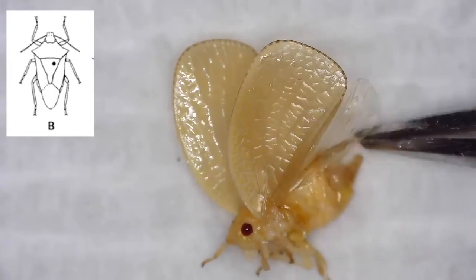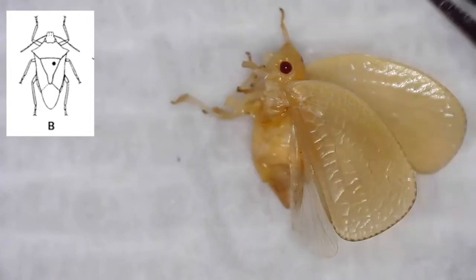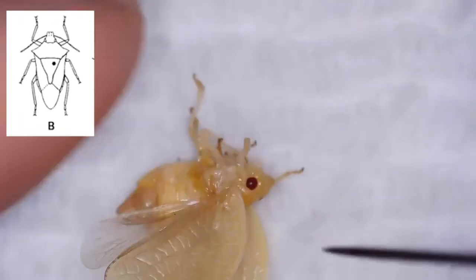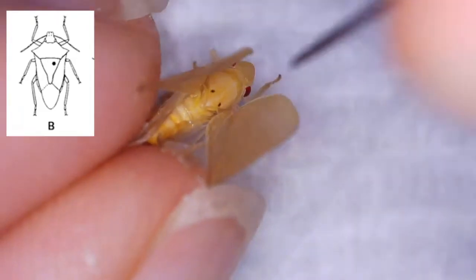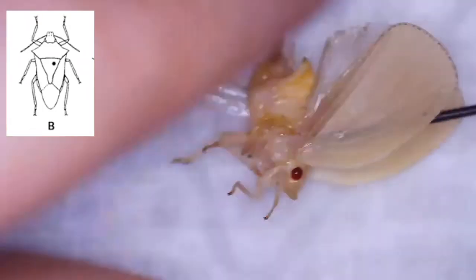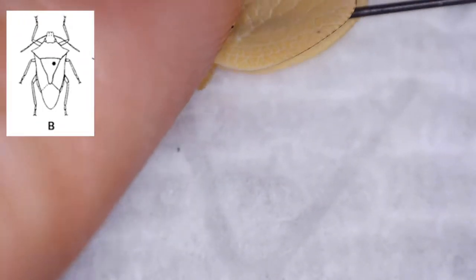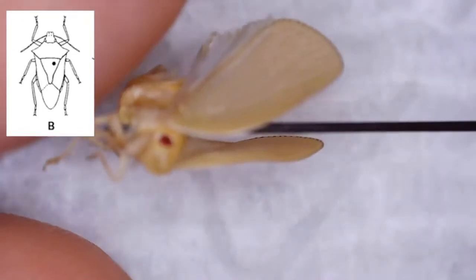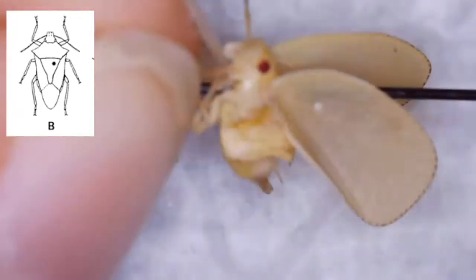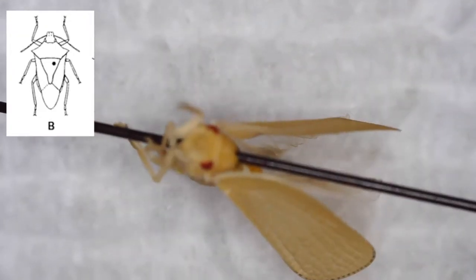Our next insect is a hemipteran. You can see in that image from Purdue Extension that you pin hemipterans slightly right of center through the scutellum. This is a little bit hard to see in this guy, but I'm trying to get it slightly right of center. Again, I'm repositioning so that my pin is perpendicular to my insect. Since I don't have a pinning block, I gently shove that up to about two-thirds of the way up the pin.